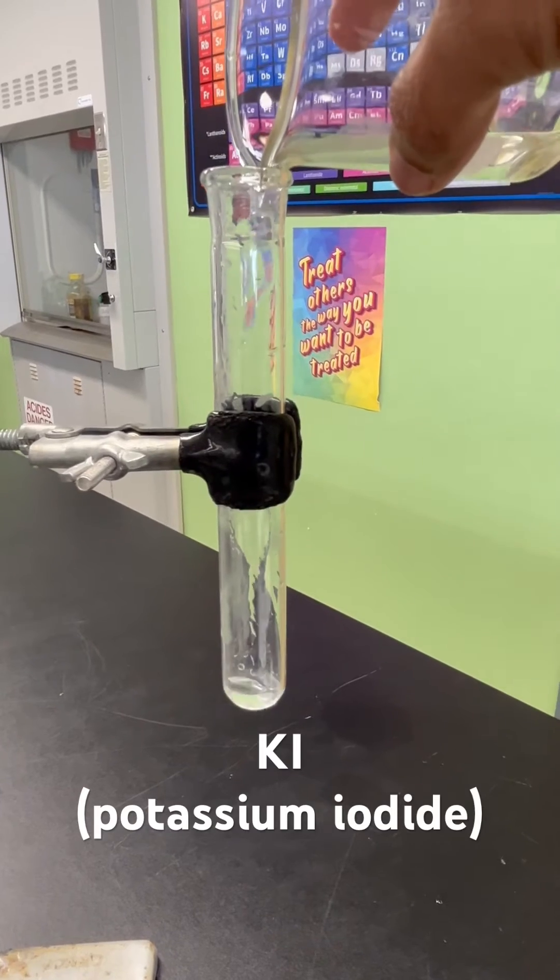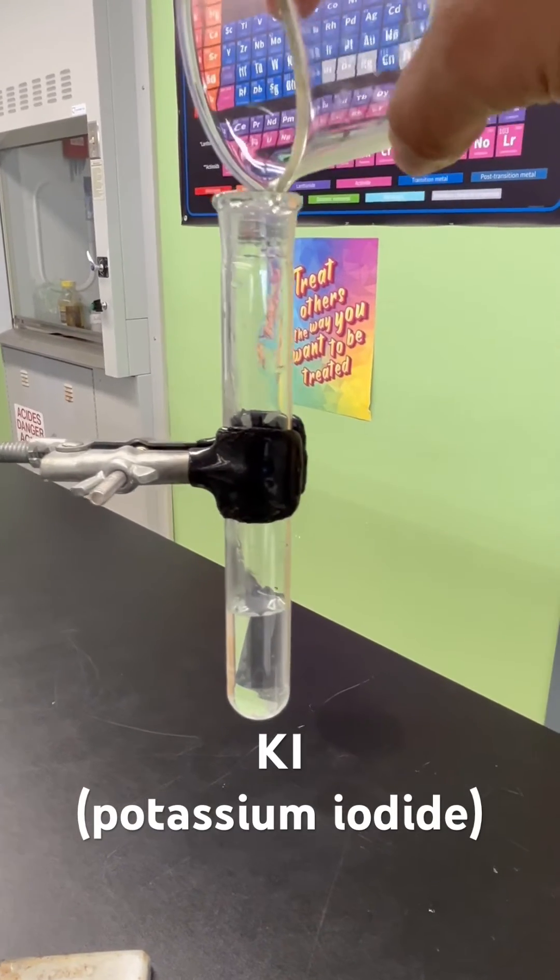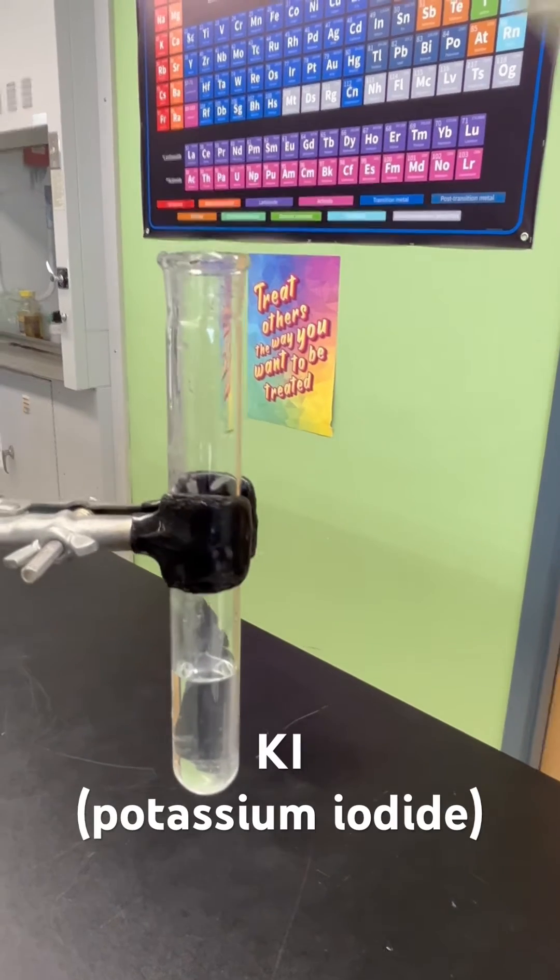We're going to add some potassium iodide to our test tube, which as you see is clear, a colorless liquid.